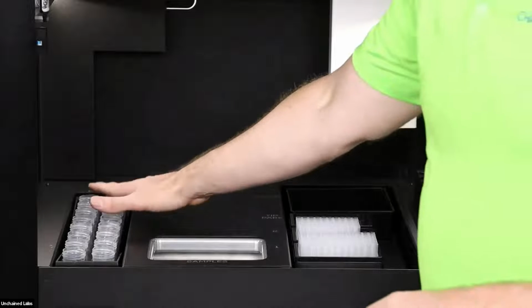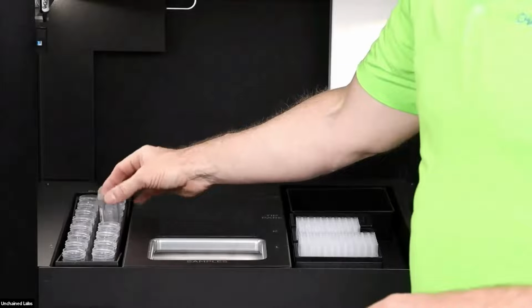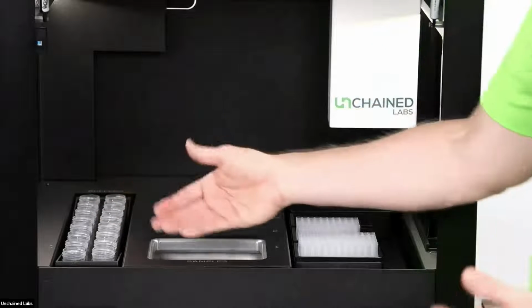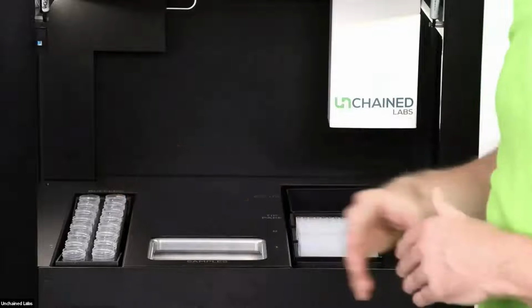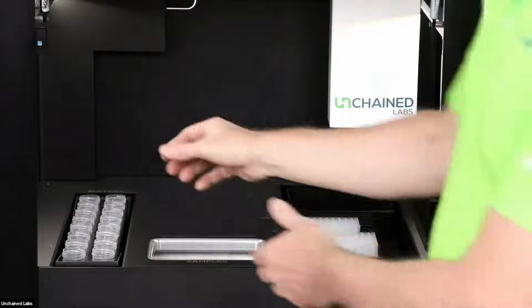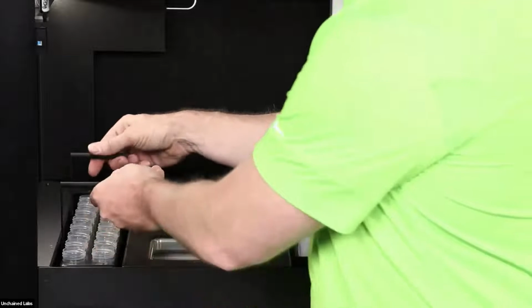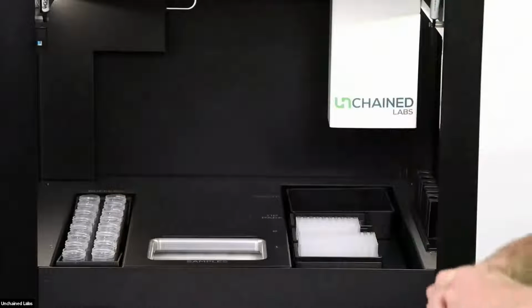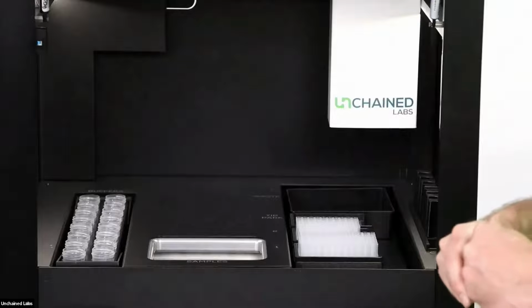Unagi being lower capacity, the buffer reservoir is actually in a 50 mil conical tube. If we want to throw out a name brand, your Falcon tube, but really any 50 mil conical tube that fits that dimension will work. I don't want to mess anything up, but it too also has a buffer rack, so if you want to prepare those buffers at your bench, easy peasy, you're able to transfer it back to the Unagi.